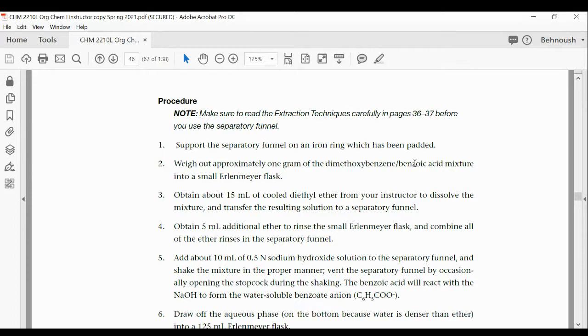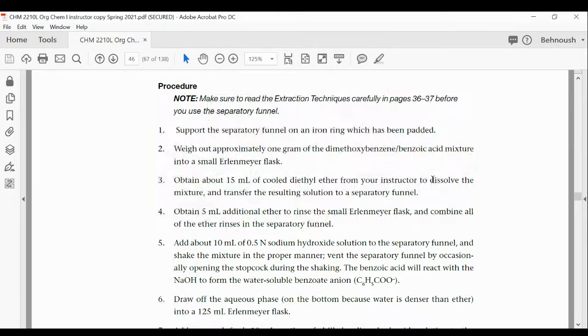The perfect situation would have been to homogenize it, change it to powder, and then take the 1 gram. But the purpose that I did not do that in this experiment is to show you that we are dealing with 2 compounds to begin with, and then we recover the 2 compounds. So it could have different benefits. If you get more than 0.5 for one and less than 0.5 for the other, it is possible because your original sample was not a perfect 50-50% mixture.